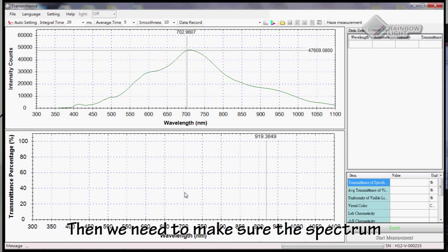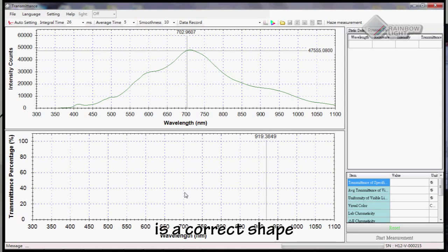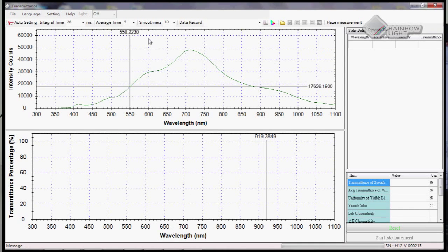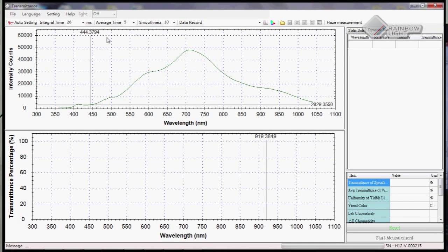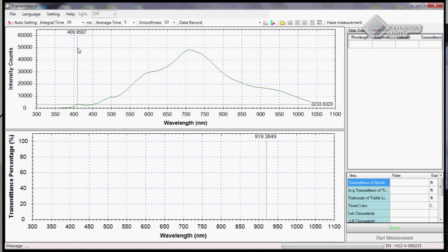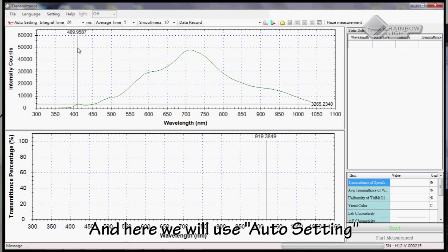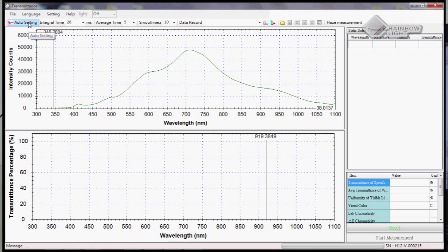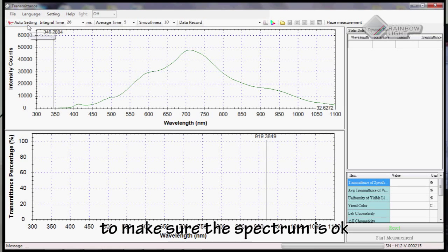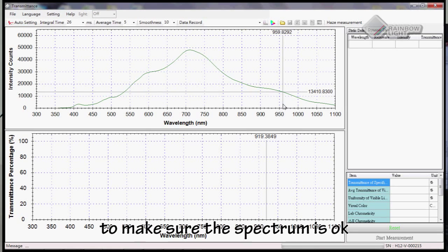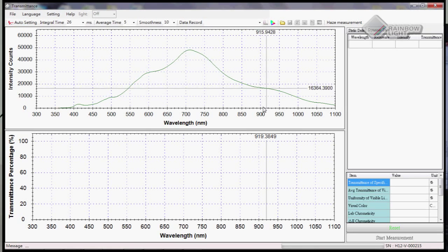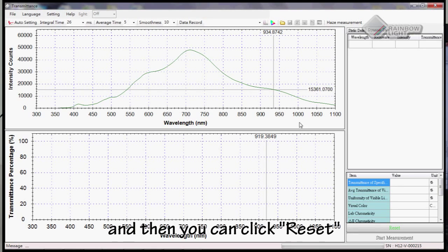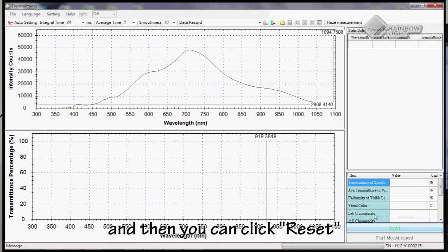Now we need to make sure the spectrum is the correct shape. Here we will use auto setting to make sure the spectrum is okay. Please wait until the spectrum becomes normal and then click reset.